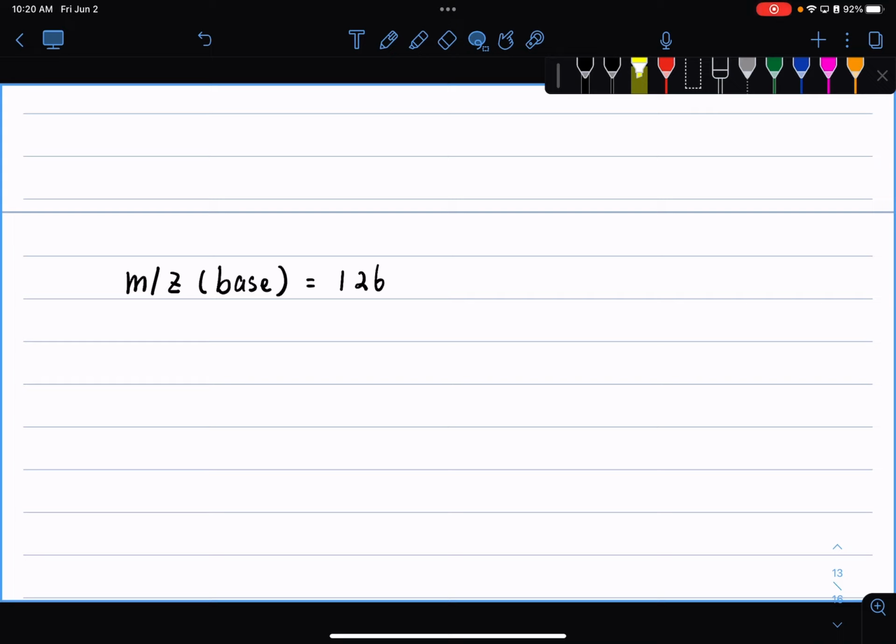All right, so with me so far, we're talking about the isotope effect. And we have the isotope effect when you have isotopes of similar natural abundance, like in this case, bromine. So that's why we show the isotopic effects. And if we look at the base peak, it doesn't have any isotope. So that means our bromine atoms are being lost in the process of fragmentation.